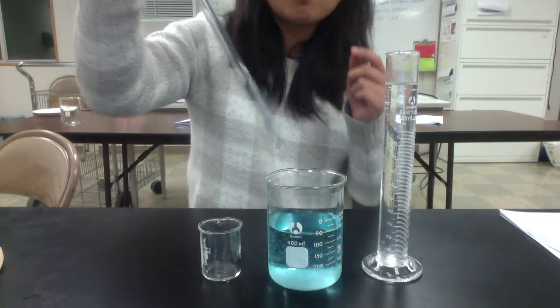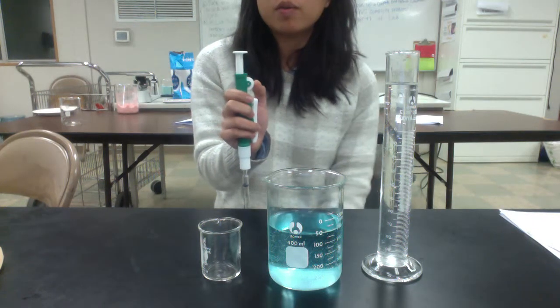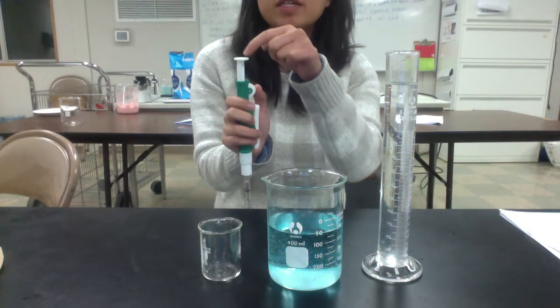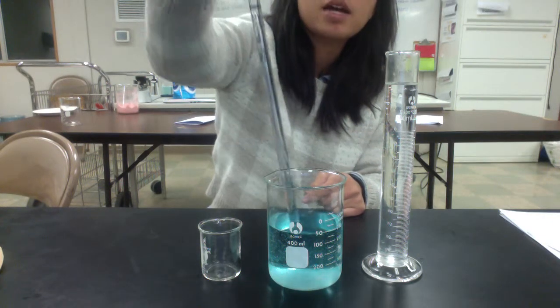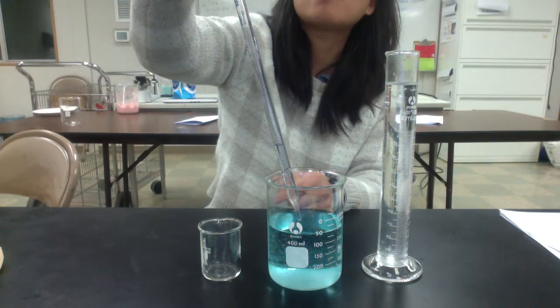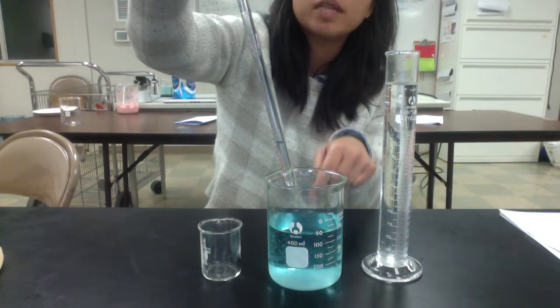If you roll your thumb the opposite way, in an upward motion, this is going to go downward and eject the liquid. So let's say you want to hit the 7 line and you got too much, just roll your thumb towards the sky and the liquid will go down.